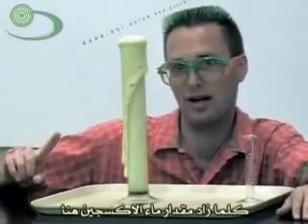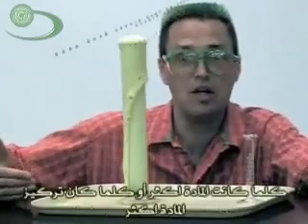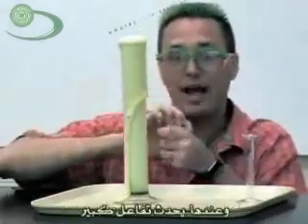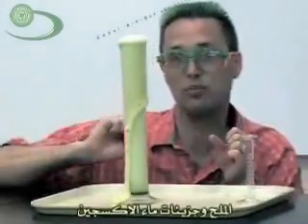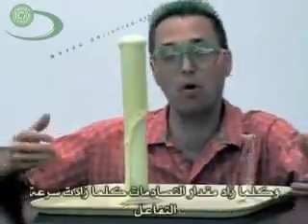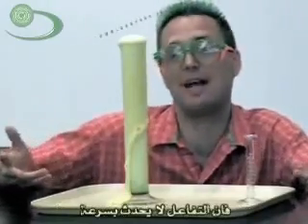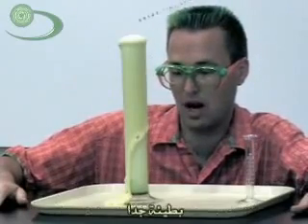The more hydrogen peroxide that's in there, the faster this should happen. That's one of the things about concentration. The more concentrated a substance, not just how much it is, but more concentrated, the more likelihood that two molecules will collide and then have a reaction happen. So in this case, the salt and the hydrogen peroxide molecules will collide, and then you get a reaction. And the more likely they are to collide, the faster the reaction will happen. And since we have less concentrated hydrogen peroxide in here right now, it doesn't happen very fast. Well, this is still moving kind of slowly, very slowly.